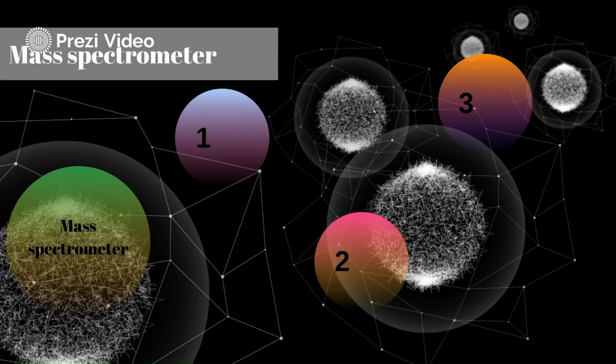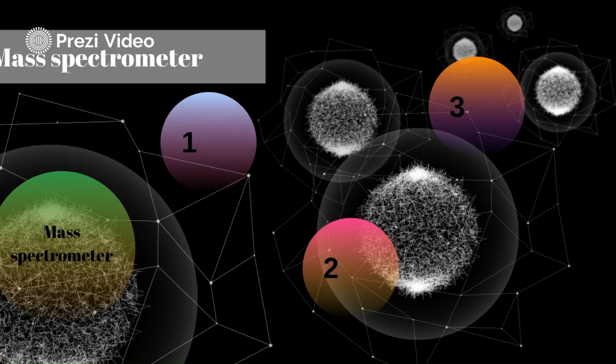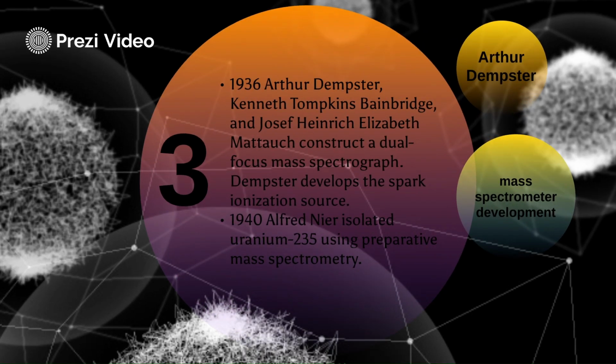Thomson decided to measure the mass and charge of these new beams, also using electric and magnetic fields to deflect the particles. His apparatus for studying positive rays, the mass spectrograph, is shown schematically in Figure 2. It differs from the device shown in Figure 1, by the fact that the electric and magnetic fields deviate the particles at right angles to each other, and therefore it is not possible to obtain a zero deviation.